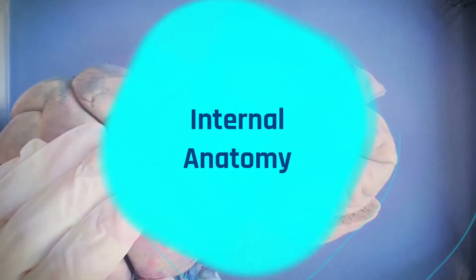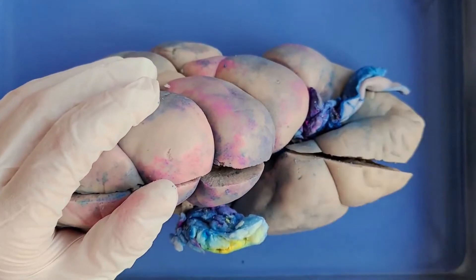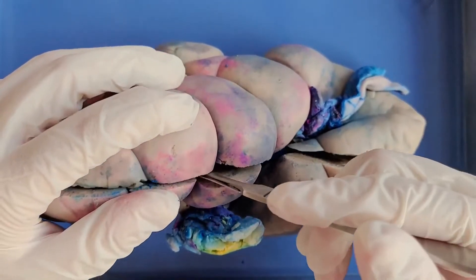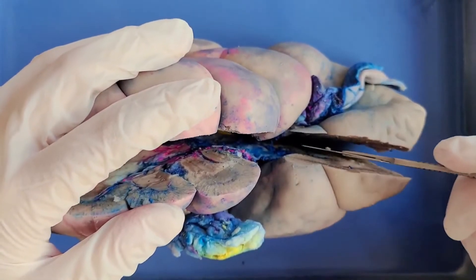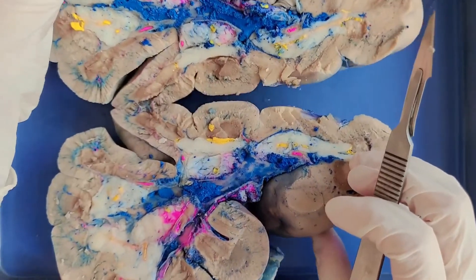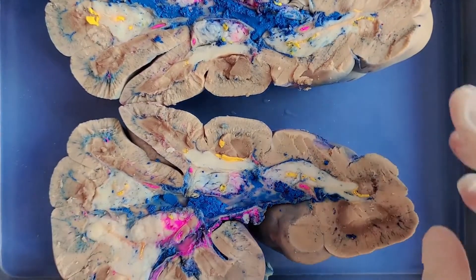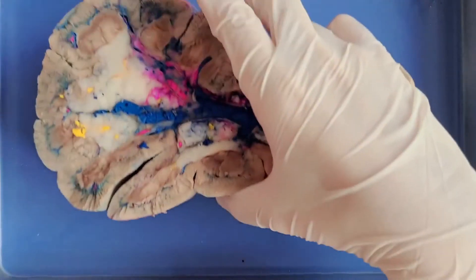So now let's take a look at the internal anatomy. We actually lost the footage of bisecting the kidney, but basically you take a scalpel and cut it in half down the midline, all the way around in multiple strokes. Then you can open it up like a book. Let me just finish cutting through this section — and there we go. I'll move one half away and we'll take a closer look at the other half.